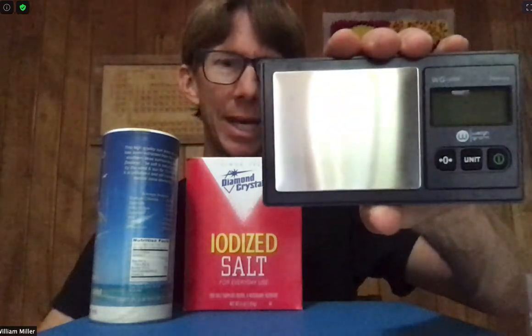I've got my scale that records 200 plus grams to 0.01 gram accuracy.